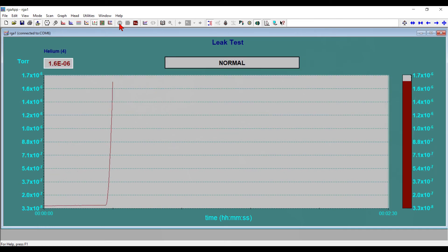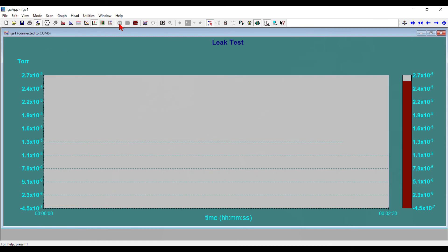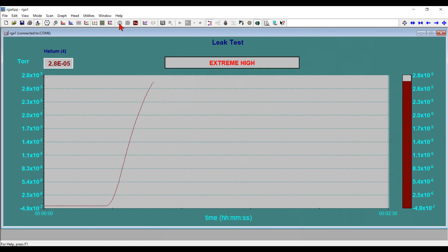Now you can see that there's a huge increase in the helium signal, and it continues to increase. Now I'm going to pull the helium away — and you'll notice it's still increasing. That's because the ion pumps have a very hard time pumping helium, so it's going to take some time for the ion pumps to pump this helium out of the chamber.